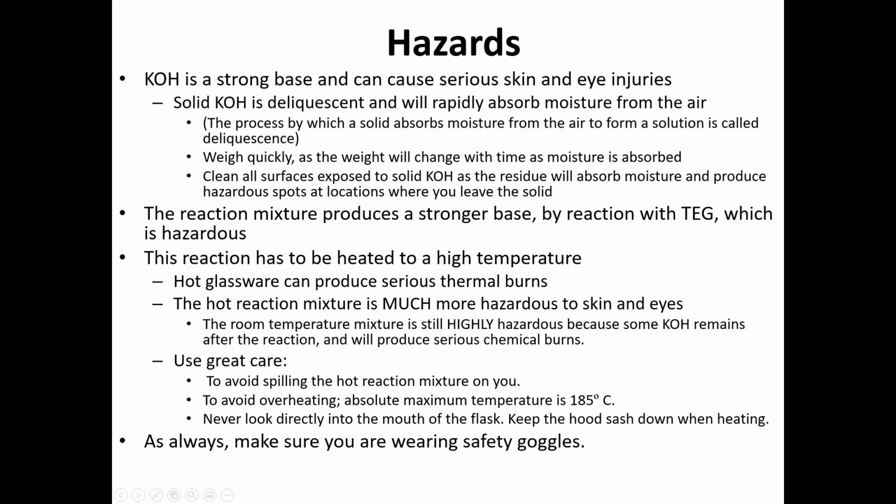So not only are we working with a strong base, but we're working with an even stronger base when we have our TEG base. So again, same thing about it causing serious skin and eye injuries, just a little bit worse.